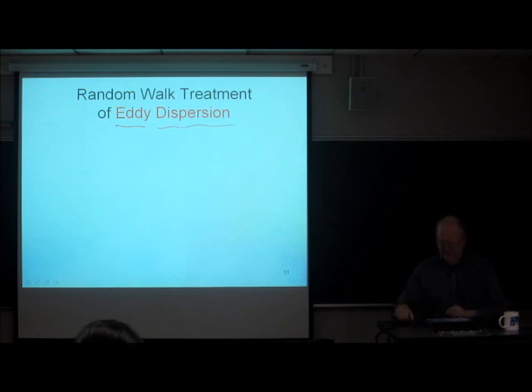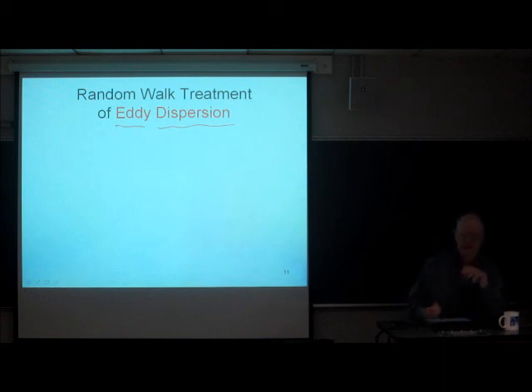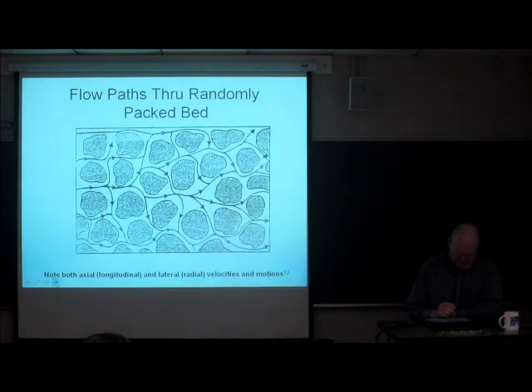Now the eddy dispersion process is the final thing, and we'll first work the problem so that we use some of the ideas that Van Deemter and his crew used, but basically we're going to be applying the Giddings ideas of a random walk model to do it. But first I want to make sure that we understand the physics of what we're talking about.